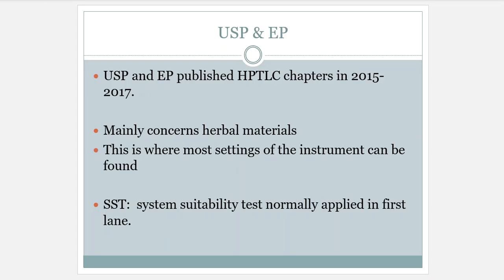Also, with these, you're going to be running an SST. SST means System Suitability Test. This is the concept that you're running a standard, and that standard should be giving you a preferred result, and we know what this is going to be. This standard has a documented RF.